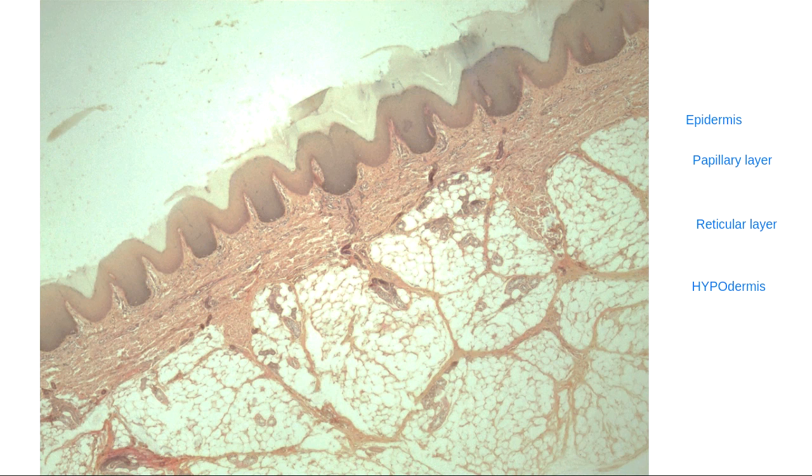Adipose loose connective tissue. I really should have just done CT. We're just going to do CT.